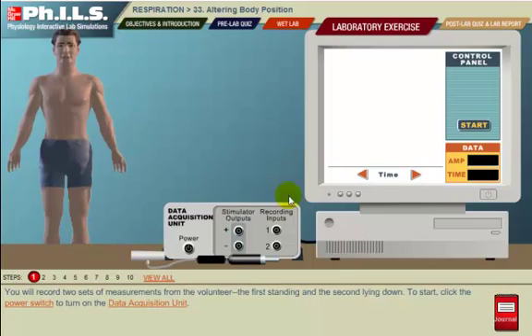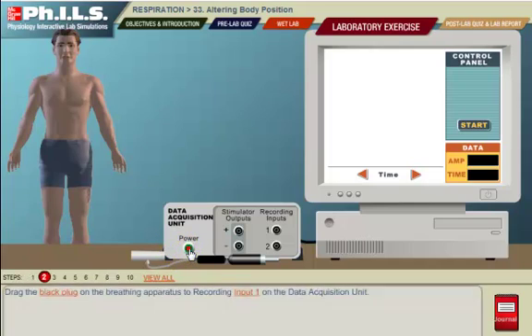The first thing in this experiment, this one tells us to start, click on the power switch. In case you don't know where the power switch is, you just click on this and you see a blinking arrow that tells you to click here. So this is going to be our first thing. Click on power, and now the power is on.